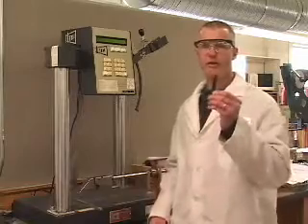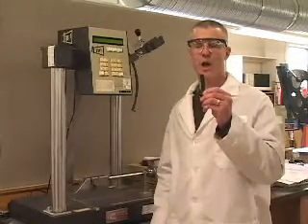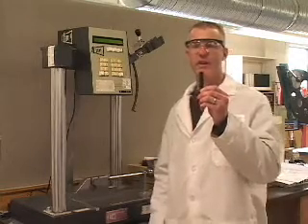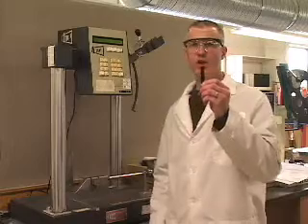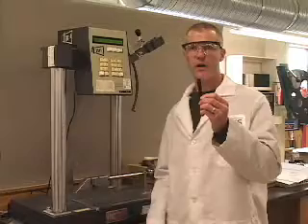Essentially, a bar of uniform cross section — typically two and a half inches long by half inch width by thickness, which is typically an eighth of an inch — has a single notch of a very specified dimension in the center of the bar.